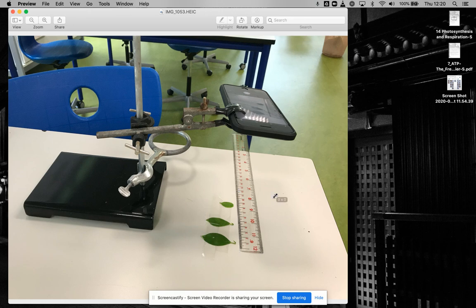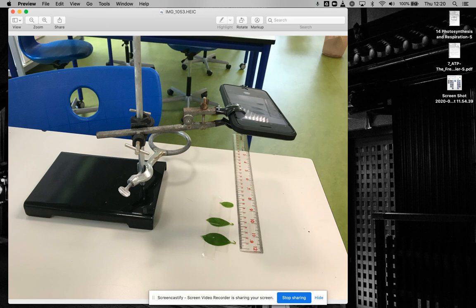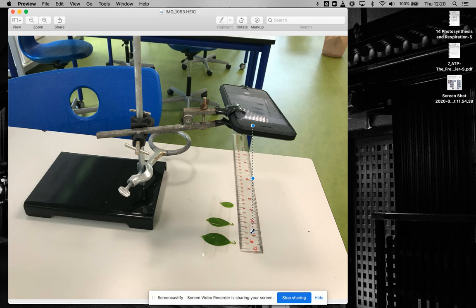Crucially, you have a ruler here, and I'll show you why that's important later. As long as you have this setup and you don't adjust the stand or the distance the camera is away, you can use this setup to collect all your data.